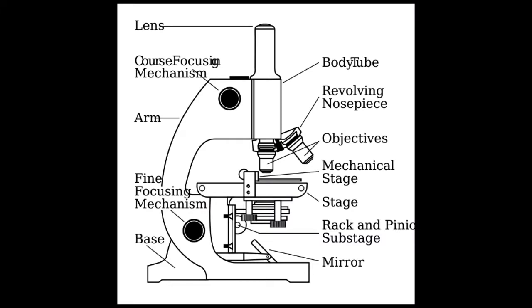Firstly, you need to be familiar with the parts of a microscope so you know what I'm talking about when I go through the video. So take a look at this picture, pause the video and try to remember as many parts as you can.